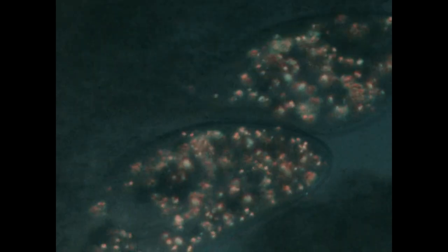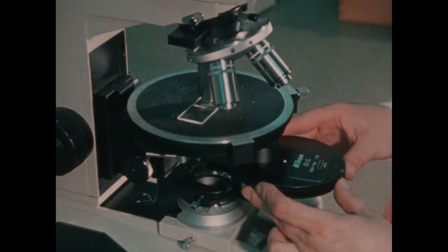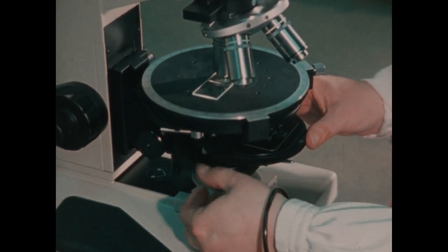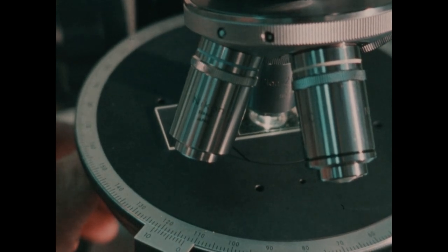In living specimens, cross-polarized lighting may reveal hidden details, like the arrangement of muscle fibers in our transparent lake dwellers, or crystals within a living paramecium, features virtually undetectable under normal bright field illumination. These simple but powerful techniques provide a wealth of information. But to further explore cells and tissues, biologists require special microscopes. The two main kinds are the phase contrast microscope and the differential interference microscope. Both use complicated manipulations of light to produce their revealing images.